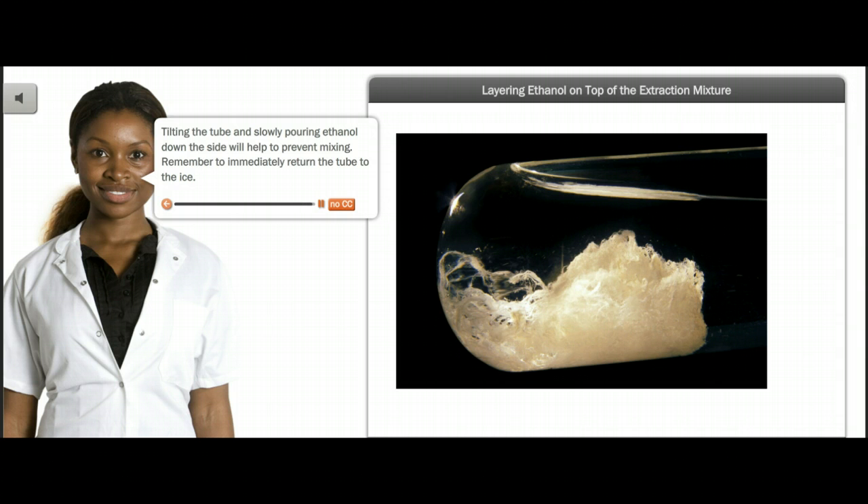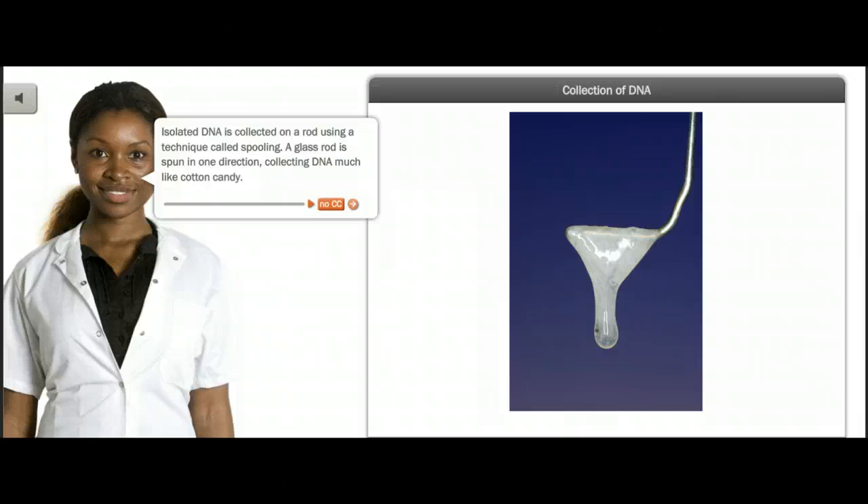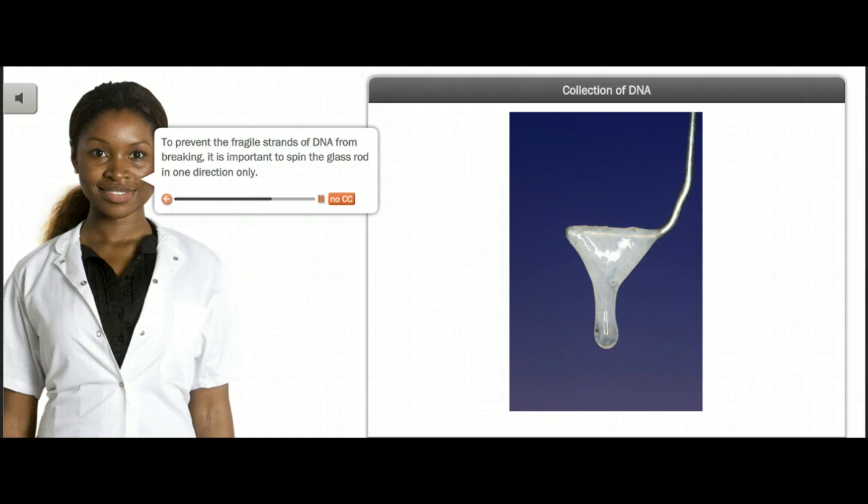Remember to immediately return the tube to the ice. Isolated DNA is collected on a rod using a technique called spooling. A glass rod is spun in one direction, collecting DNA much like cotton candy. To prevent the fragile strands of DNA from breaking, it is important to spin the glass rod in one direction only.